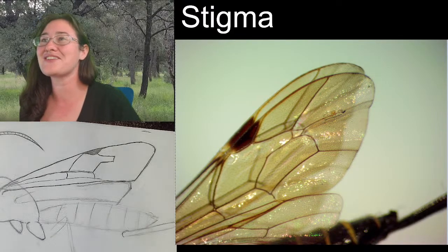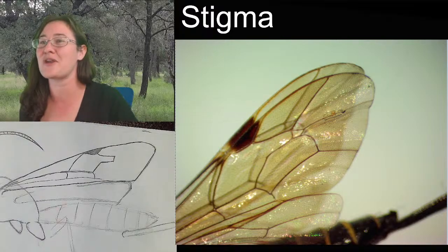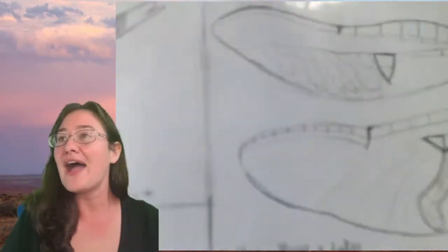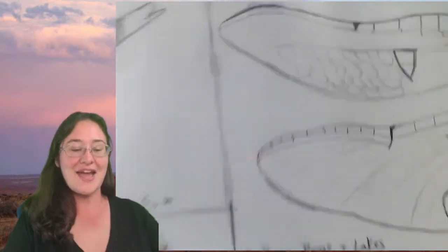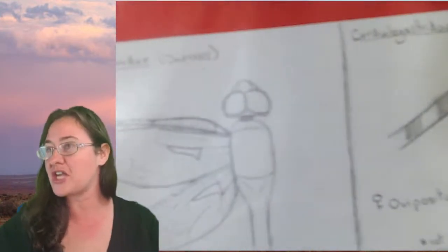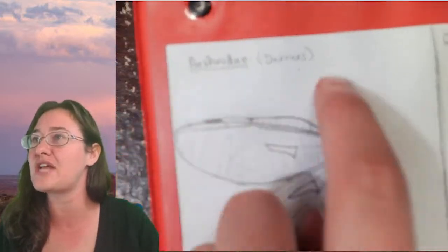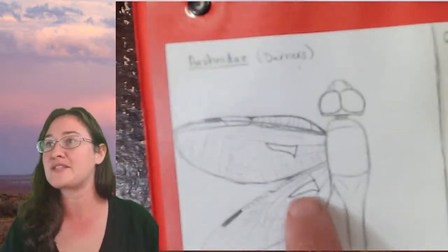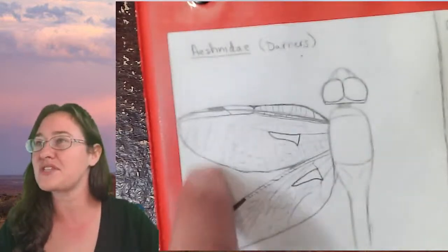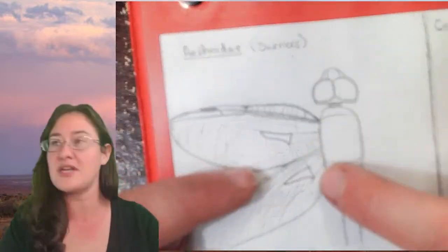And actually, we can get a little sidetracked. I know that you guys like it when I go on side kind of stories. So yes, we're sketching our wasp, but I can tell you I have sketched dragonfly wing venations because if you're talking about dragonfly identification down to family, you're looking at different characteristics in the wings. Now, sometimes I would just kind of scribble them out, but I darken the areas that are important.